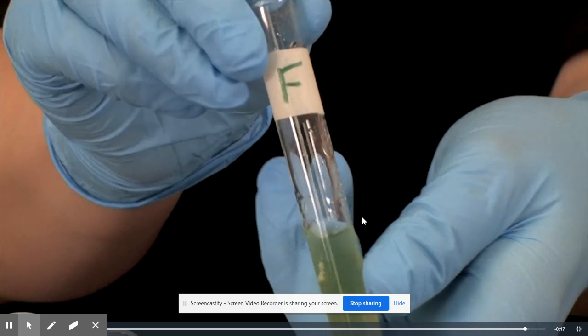Not sure if you can see here, but this is a gel. A gel did form here. There was no color change, temperature change or gas, but you did get the precipitate, which is a gel form, and therefore a chemical change occurred.